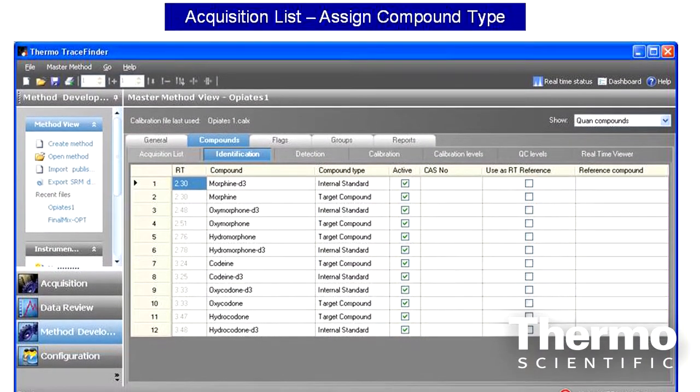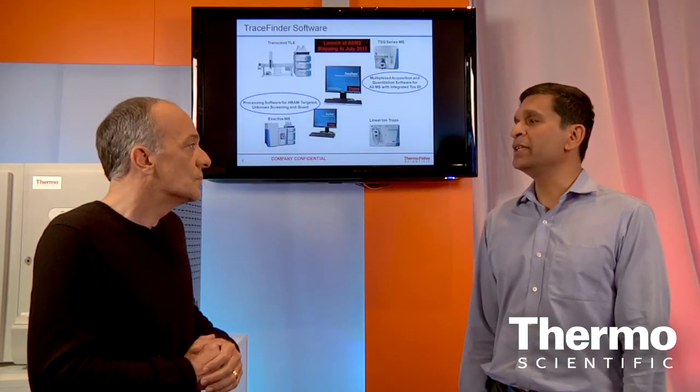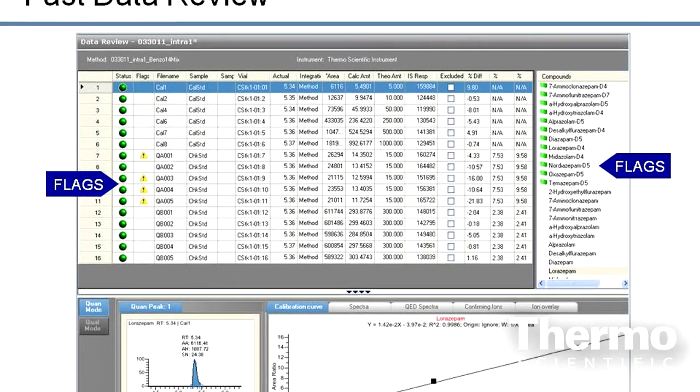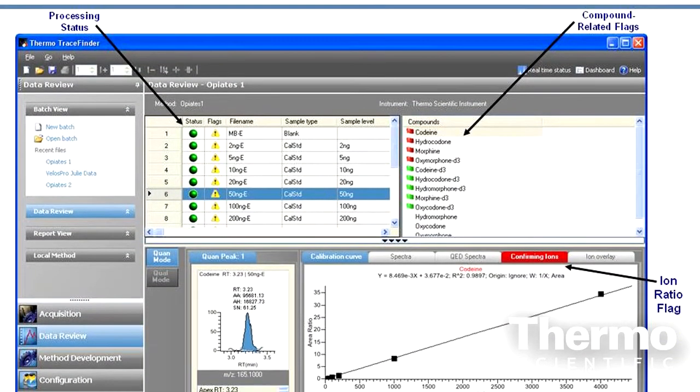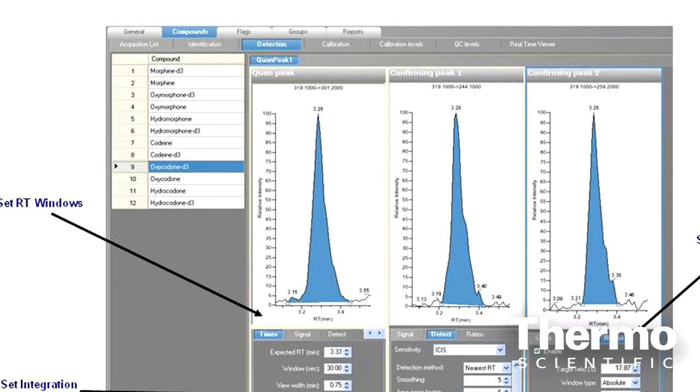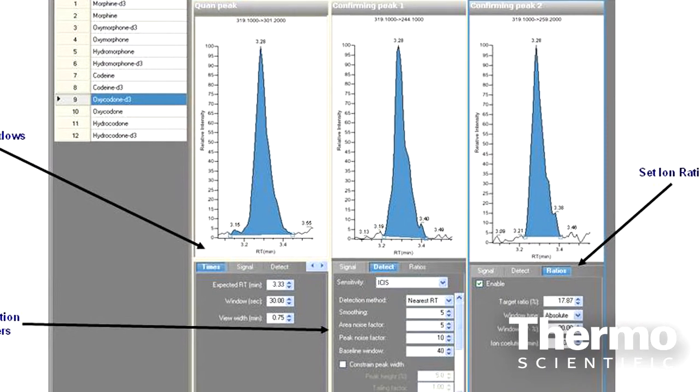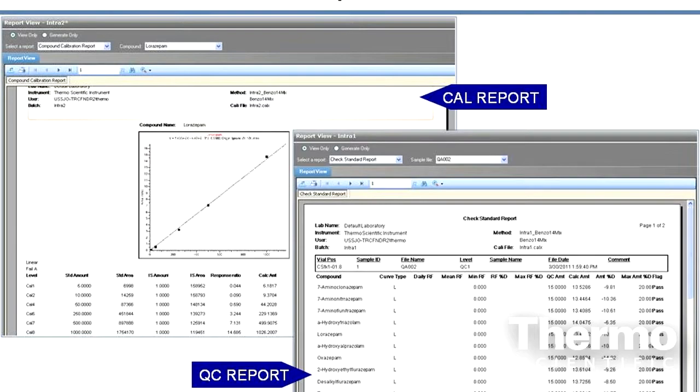As it is designed for quantitative analysis, it has some very unique and exciting features that we added over 1.0 software. Those features include extremely easy to use data review, very clear color-coded flags that tell the operator or the manager what areas they should be looking into when they review the data, and there are more than 50 reporting templates that the manager can use to report the results.